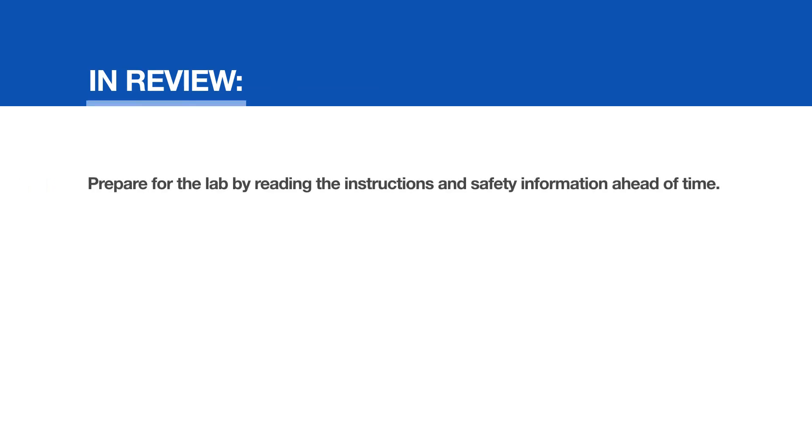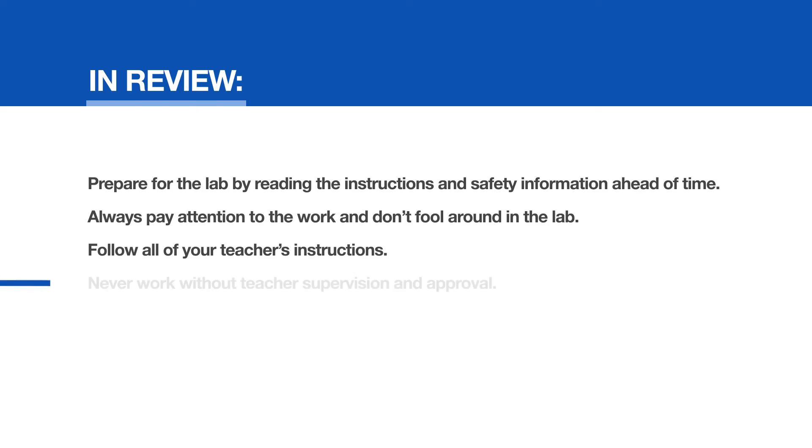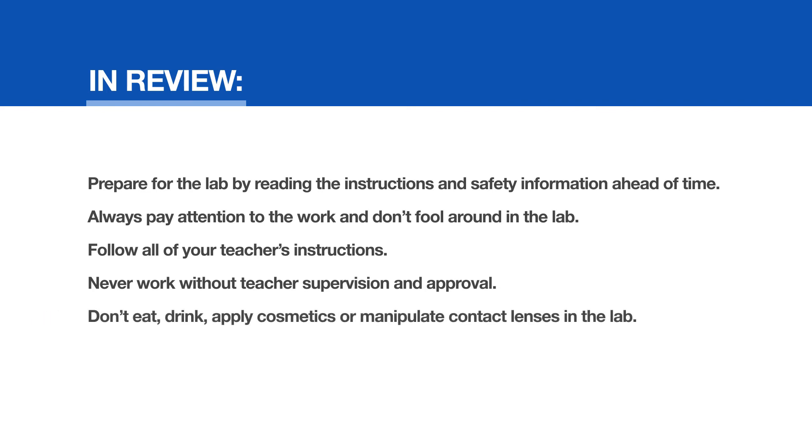General rules in review: Prepare for the lab by reading the instructions and safety information ahead of time. Always pay attention to the work and don't fool around in the lab. Follow all of your teacher's instructions. Never work without teacher supervision and approval. Don't eat, drink, apply cosmetics, or manipulate contact lenses in the lab. Stay organized and keep personal items off the tables.